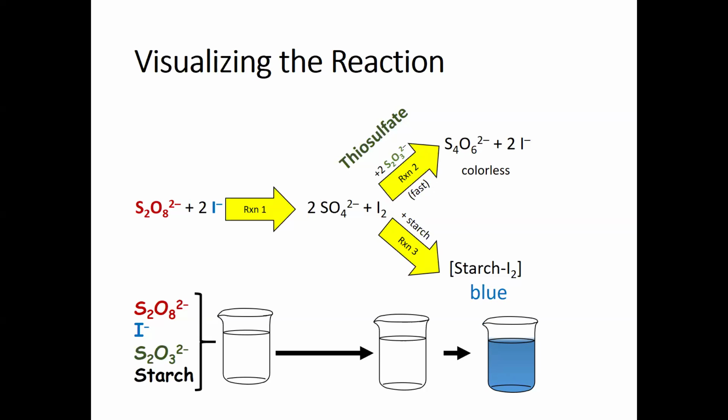How long does it take for all of the thiosulfate to be consumed and the blue color sort of coming forward? So we'll take down those measurements. How long does it take for all of my thiosulfate to get used up? How long does it take, therefore, for my solution to turn blue?